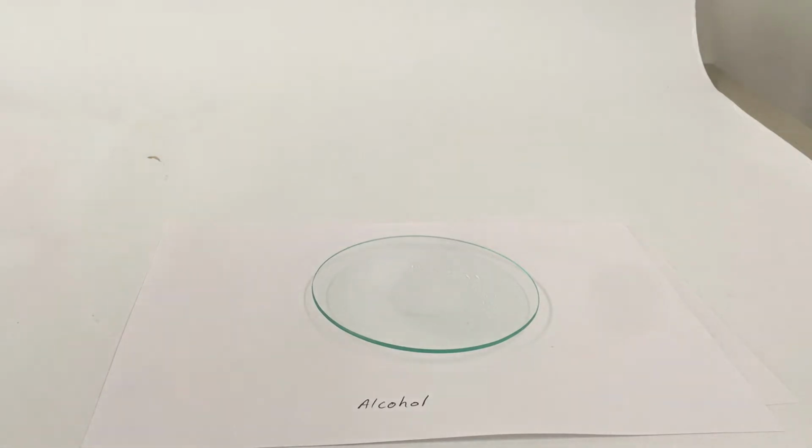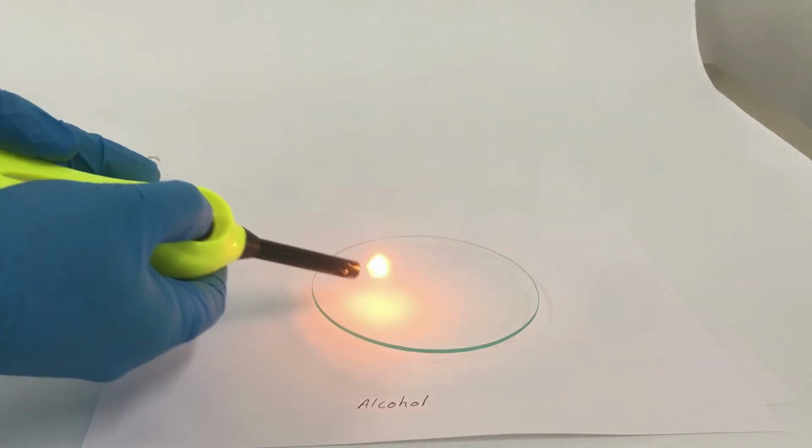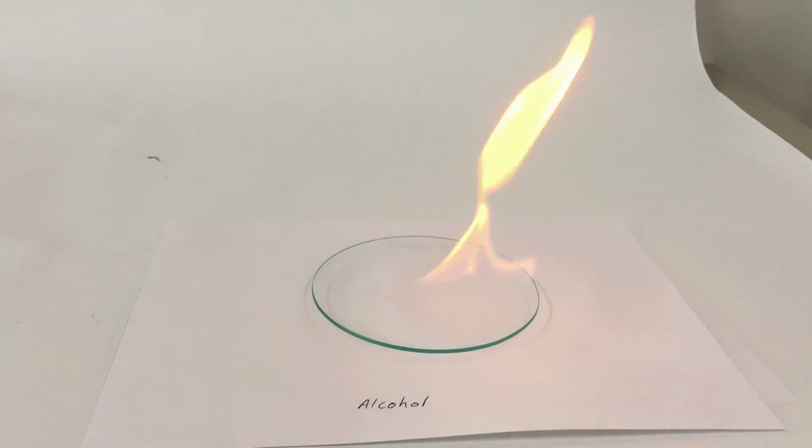Okay, and the alcohol. So again, we're using ethanol. So a lot cleaner with a distinct lack of black smoke.